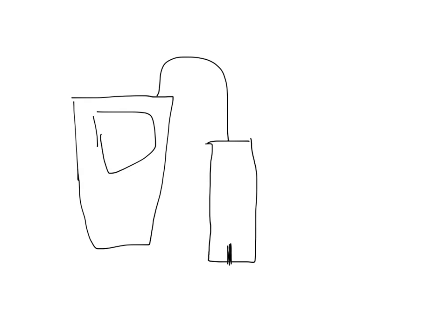Attached to your LabQuest is going to be your conductivity probe, and it's going to have a sensor right here, and that's what's going to detect those ions. There's going to be a box right here, and on this box is going to be a switch that's going to say 0 to 2,000, and that's going to be your range.